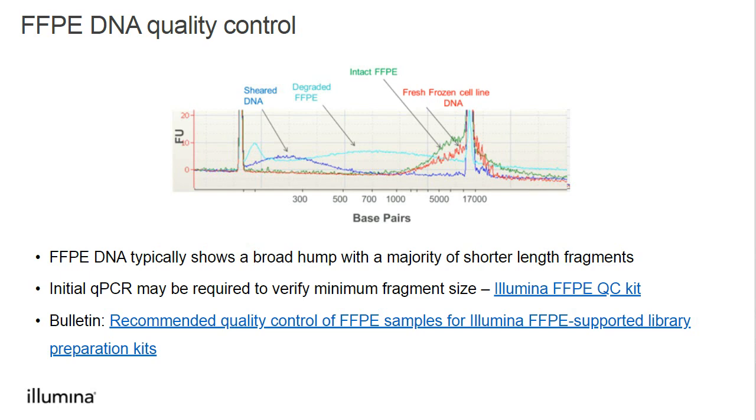I also linked a bulletin here on the next couple of slides. This is our recommended quality control of FFPE samples for our Illumina FFPE supported kits. So it's a great quick reference guide that'll go through the recommended checks before we use one of the Illumina kits.